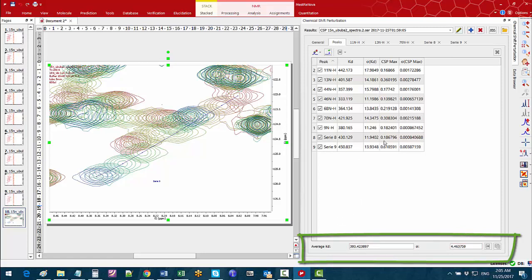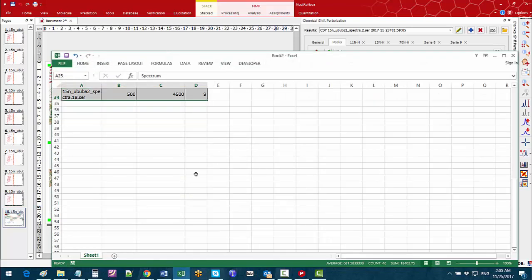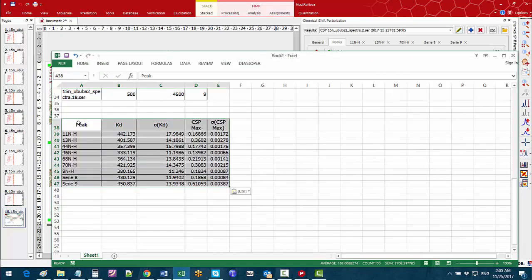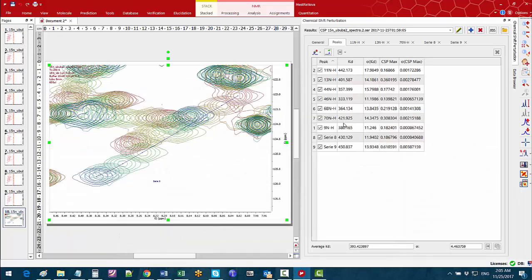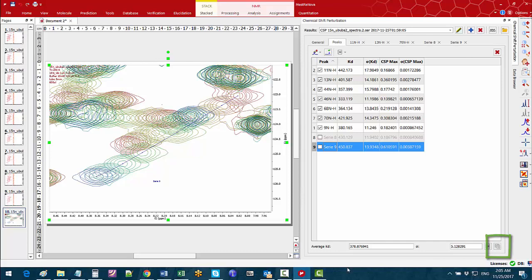If we want to report these results we can use this tool and copy and paste them into a spreadsheet. We can also exclude some of the peaks by unchecking some of the checkboxes and the results at the bottom will be automatically updated. We can also use the tool on the bottom right corner to copy the current average results and paste them to the spreadsheet.